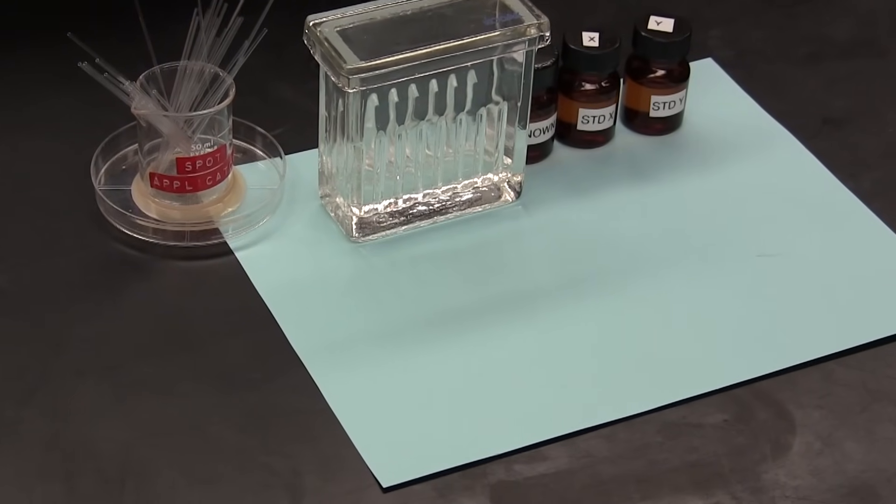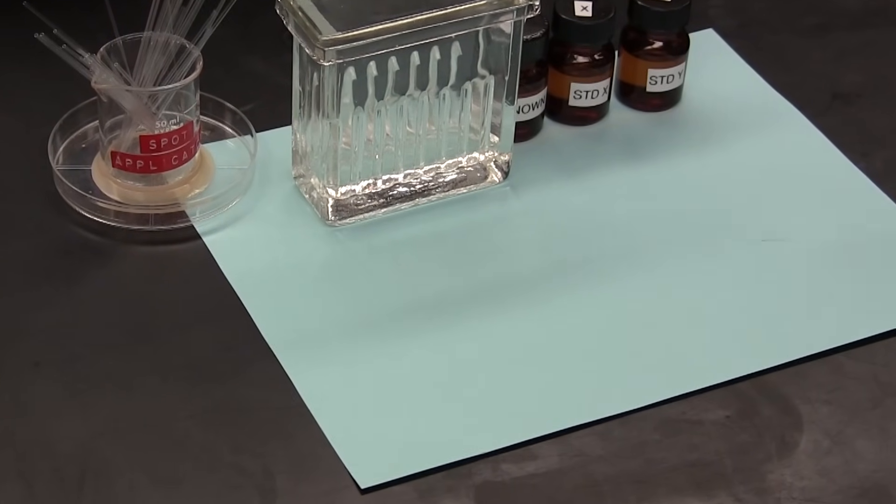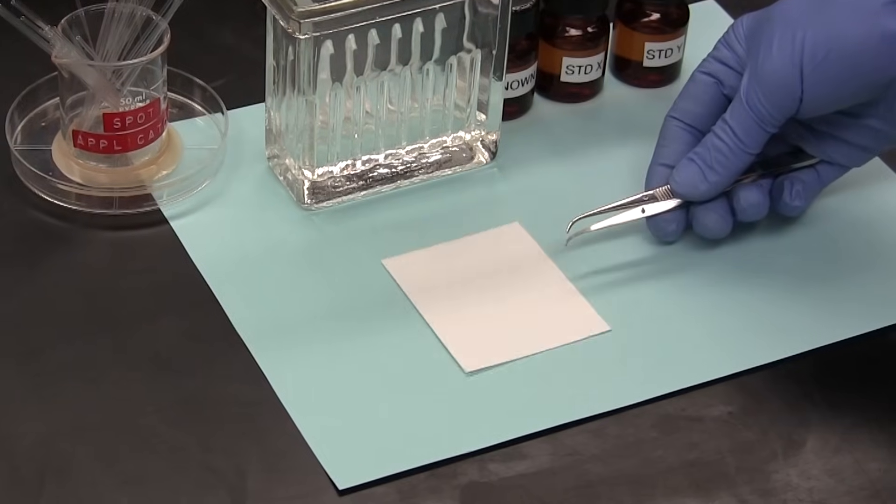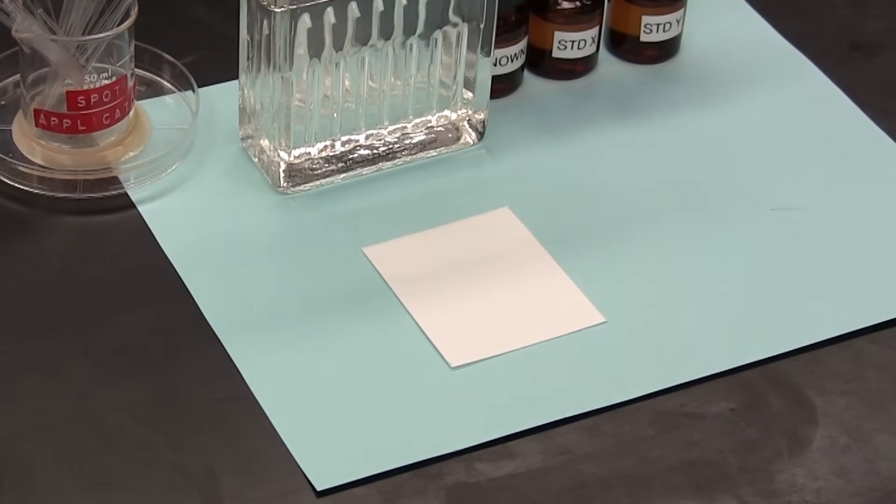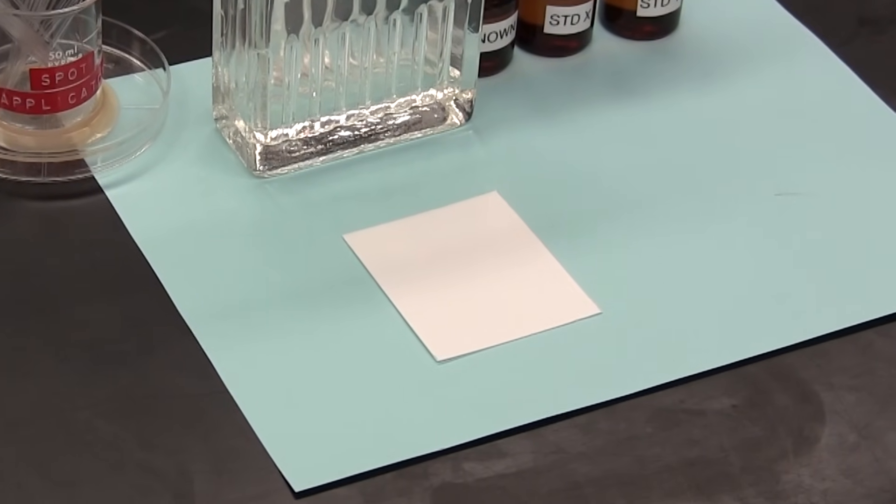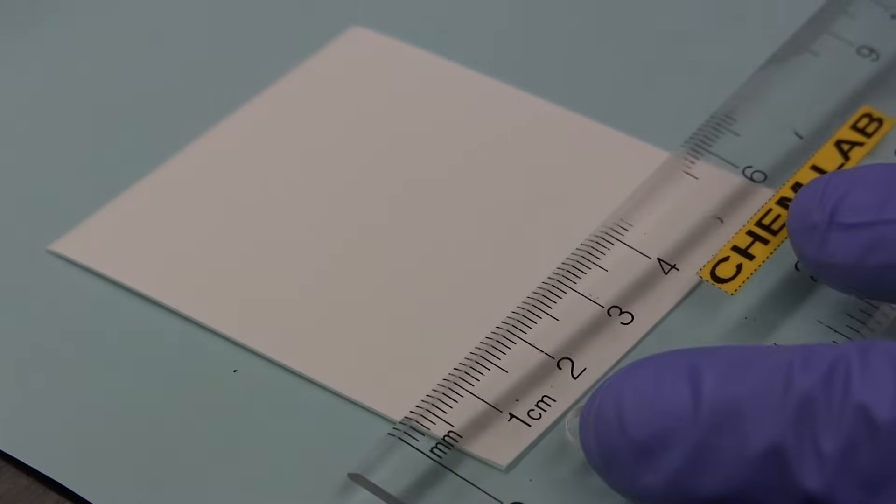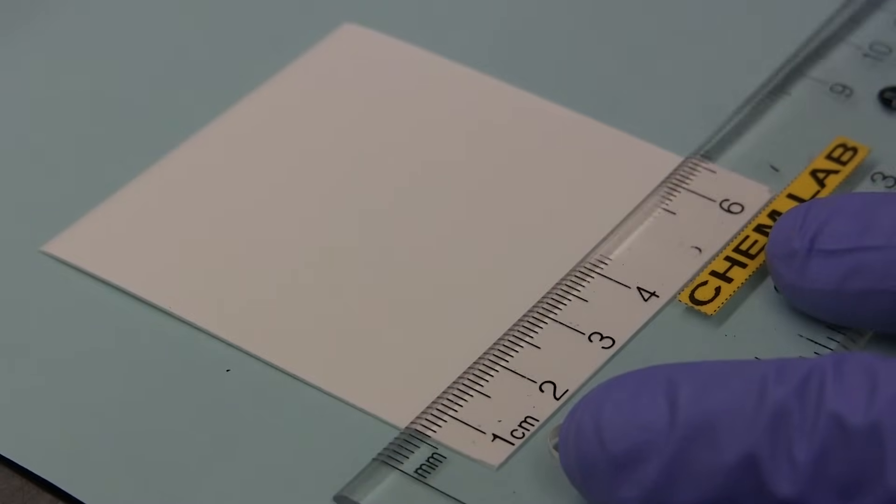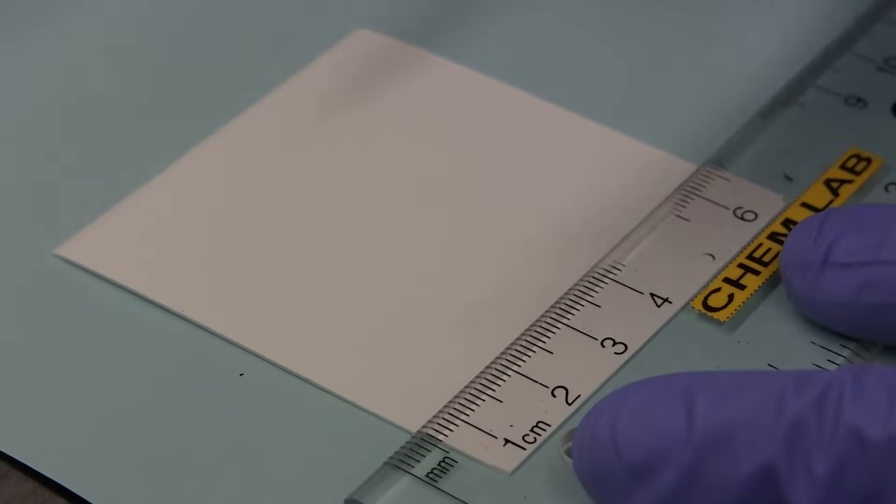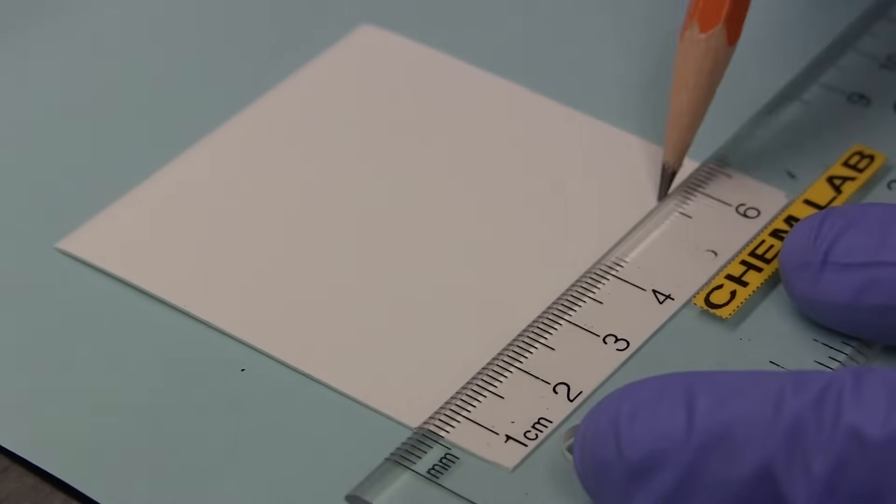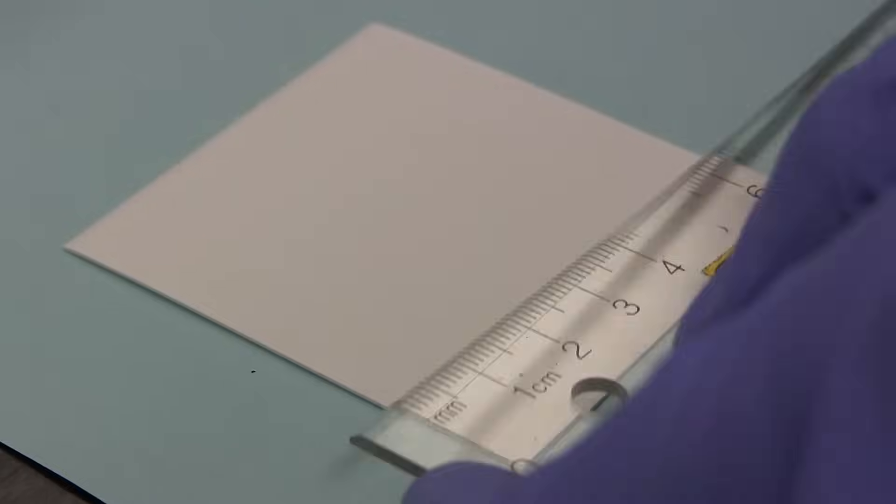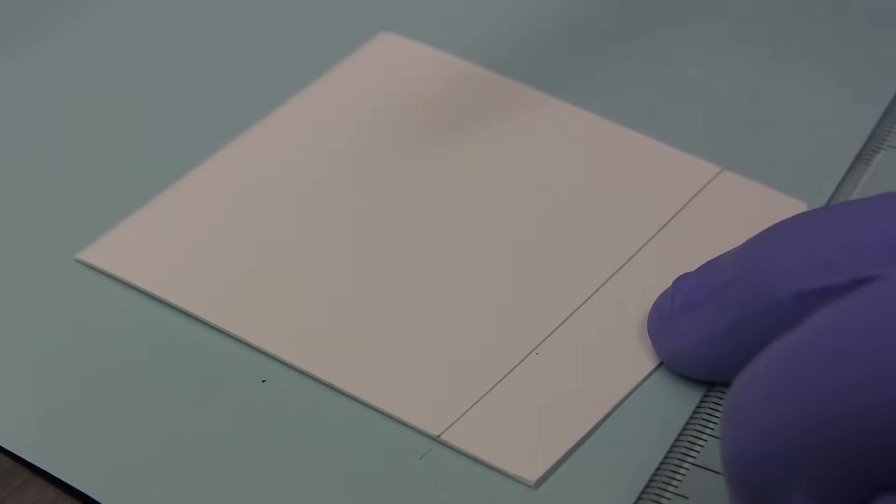First of all, we need to prepare the TLC plate. Make sure that you handle it only by its edges, or use tweezers, since we don't want to contaminate the silica gel surface. A ruler is used to draw a line using a pencil about a centimeter from the bottom edge of the plate. Draw only a very light line and try not to score the surface of the silica. This line is called the origin.